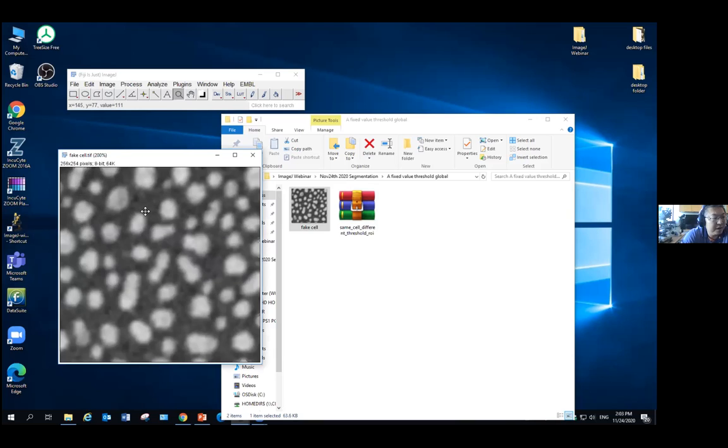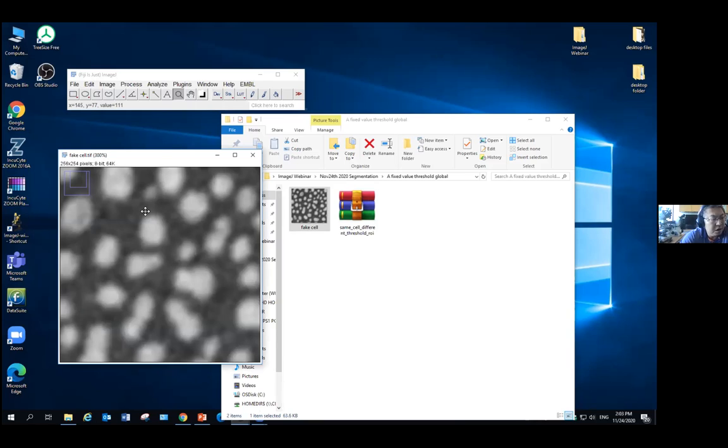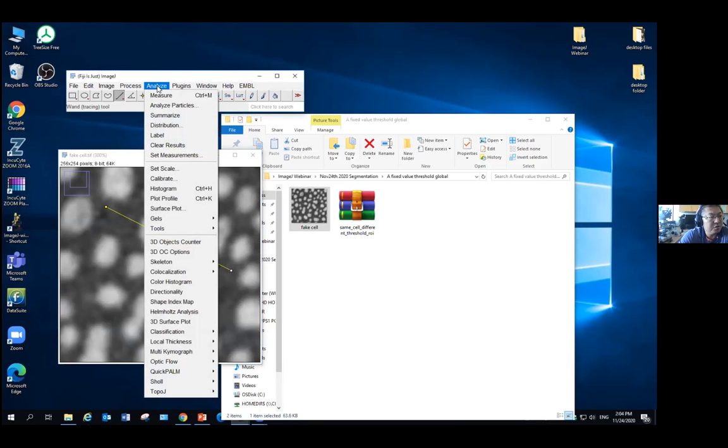So I magnify this more. Our goal for the thresholding is, when we identify the cell, our criterion is that the cell should have a strong intensity, especially if you're doing fluorescence. So the background is black and the cell is more white. If you use the line function, I can draw a line through here and go to Analyze, Plot Profile.